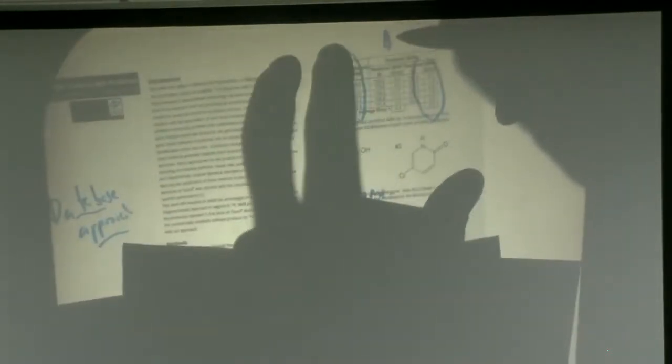But in fact, they can go ahead and calculate to within a couple of ppm. So they were able to experimentally measure the value and then say, OK, what's the deviation? And here they're getting an average deviation of about 2 ppm.